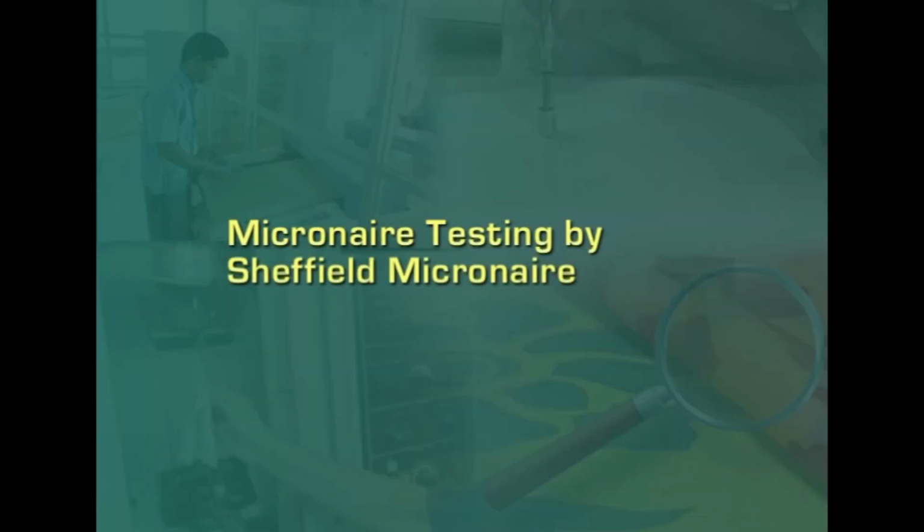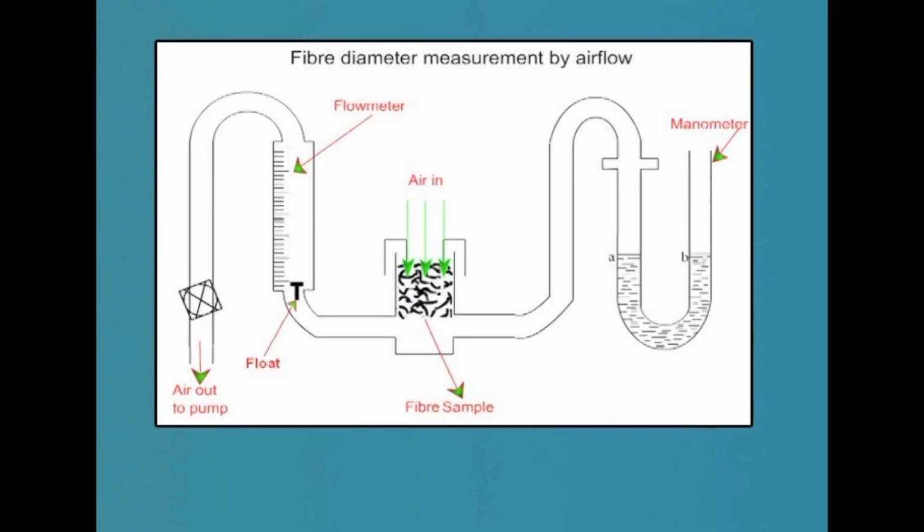Micronaire testing by Sheffield Micronaire. This instrument was first conceived by Smith and production of the development was carried out by Sheffield Corporation. A representative sample of 3.24 grams is worked into a loosely fluffy mass before being packed evenly into the cylindrical holder at the front of the instrument. A plunger is then inserted, depressed and locked into place.